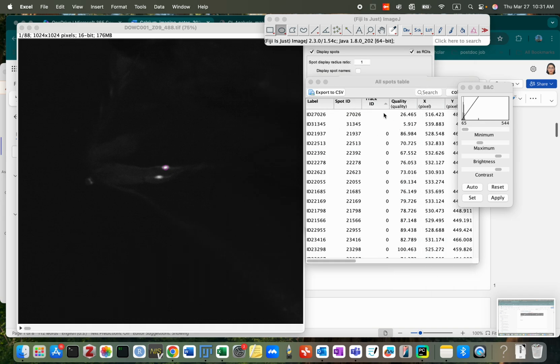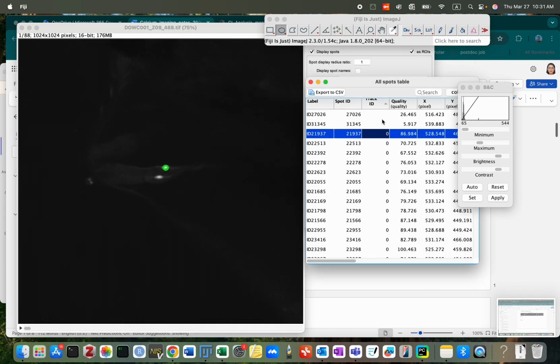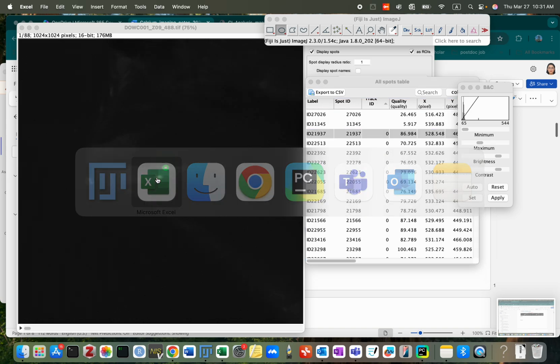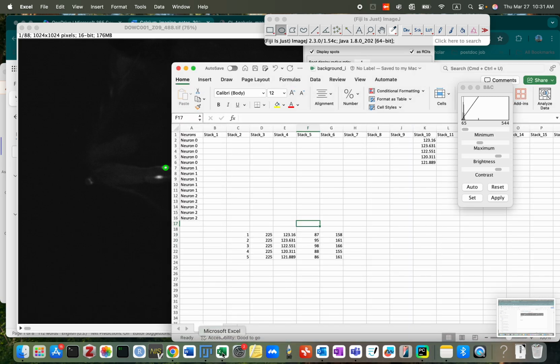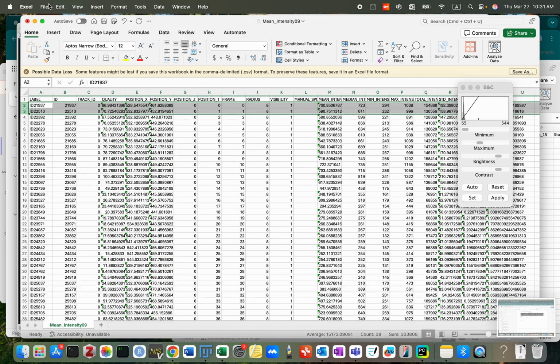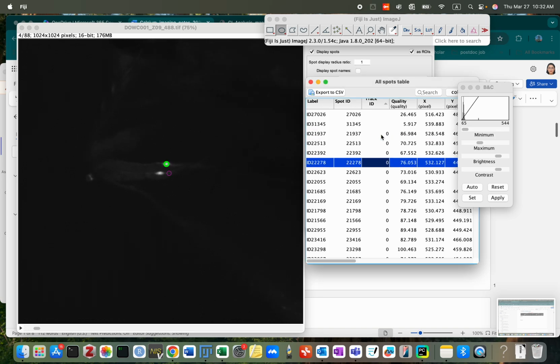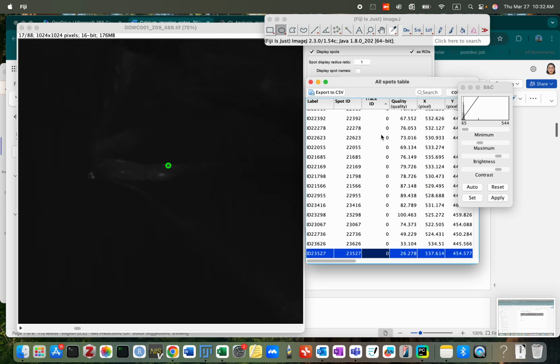Okay, so let's check. The first two are wrong, and then this is correct. So at this moment, let's delete only the top 2 data. Okay, let's continue. This is neuron 0, all correct. Okay, they are all neuron 0 for checking ID 0.